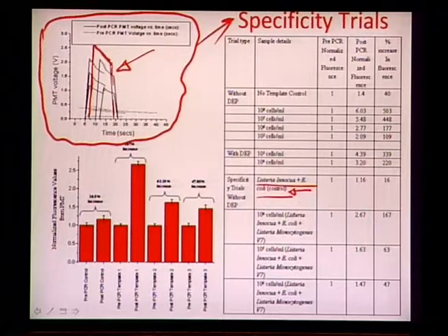H15707 strain, another in which 10 to the power 8 cells per mil of Listeria innocua, E. coli and LMV7, Listeria monocytogenes V7 strain, with a specific primer designed onto LMV7. In the second template we have 10 to the power 7 cells per mil of Listeria innocua, E. coli and Listeria monocytogenes V7, and the third we have 10 to the power 6 cells per mil of Listeria innocua, E. coli and LMV7.